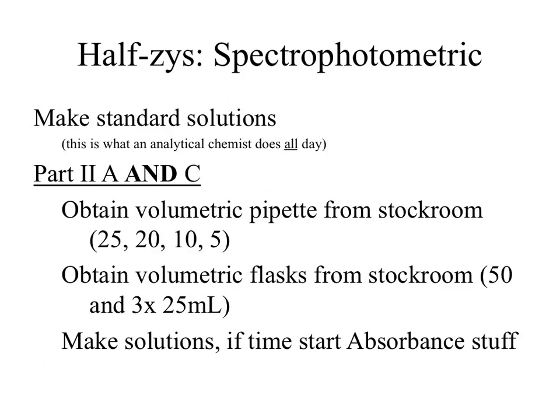What we're going to do is try and find the correct spectrum of light to use to determine our absorbance. Why is that necessary? Well, does our compound absorb all light equally? No. So if we go in and say, I want to look at how the absorption changes at 800 nanometers. 800 nanometers is relatively red.